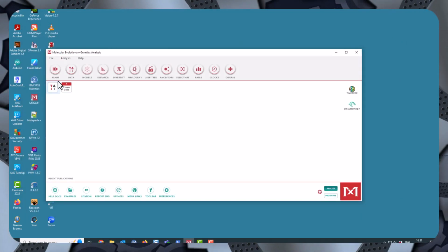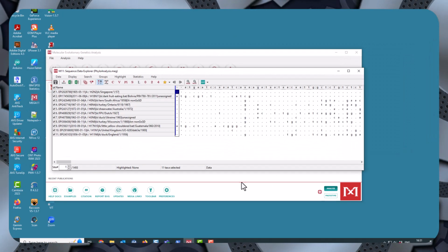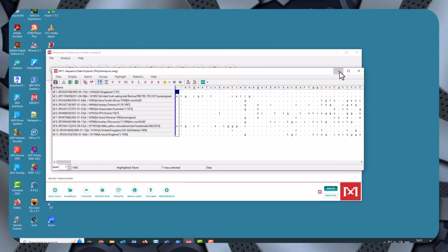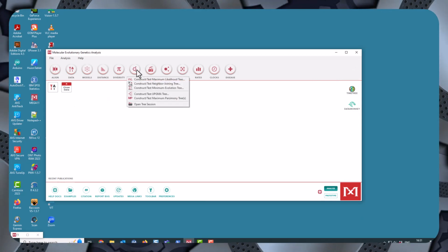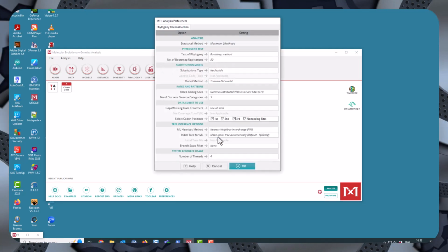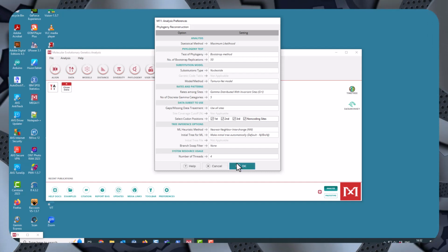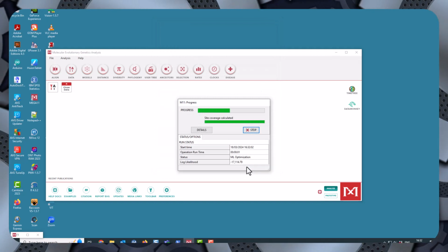We need to create phylogenetic trees, using the same methods and the same settings, for both sequence alignments. The maximum likelihood tree is the best method and the most reliable. The bootstrap value is set to 50, which is enough. It is a nucleotide substitution type, using the Tamura-Nei model, which is the default. The gamma distribution is set, along with invariant sites, and there are 5 gamma categories.